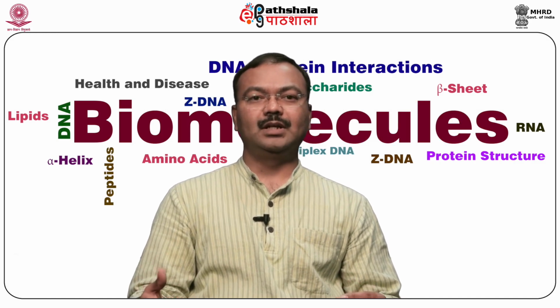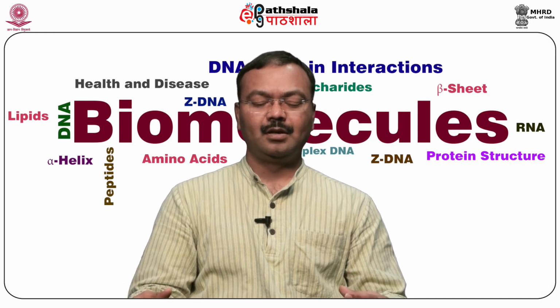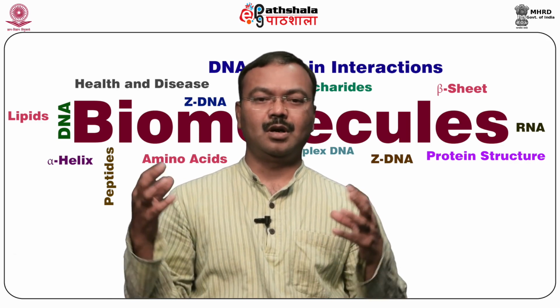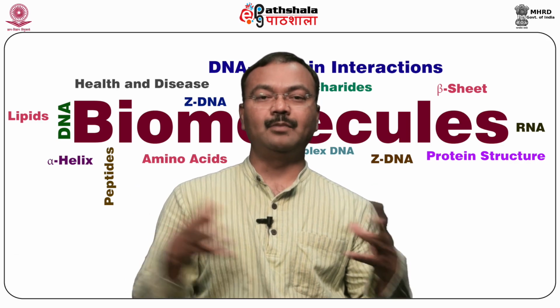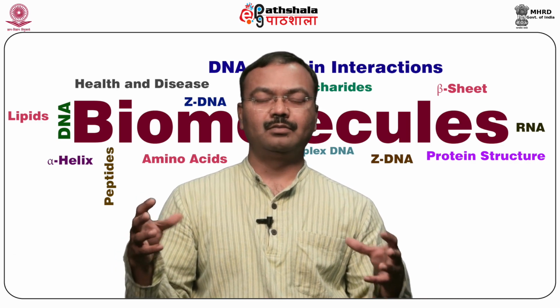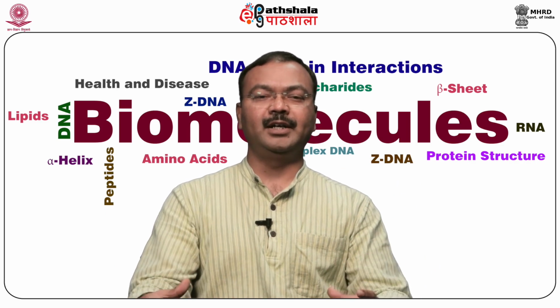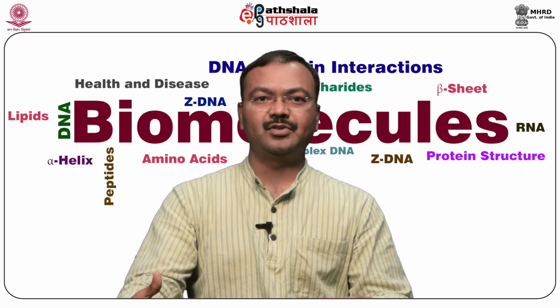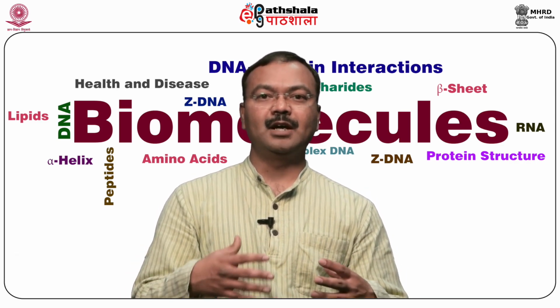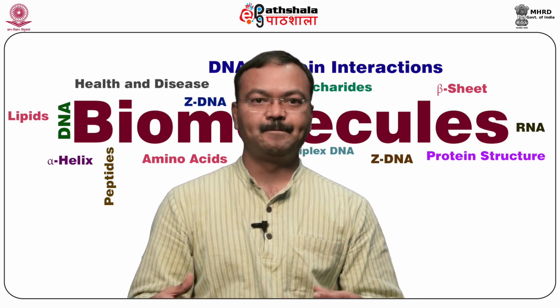Electron microscopy structure determination of protein structures has some limitations. Of course, there are advantages. It is useful for large structures or large complexes, like the ribosome, which is a classical example, or virus structures. Where large molecules become difficult to crystallize, this method gives an alternative option to determine and study their structure. And if you have internal symmetry like viruses, then it becomes easier to do the image reconstructions.